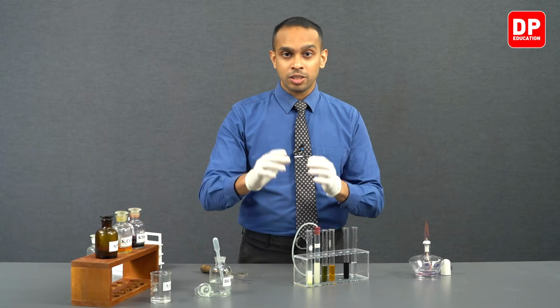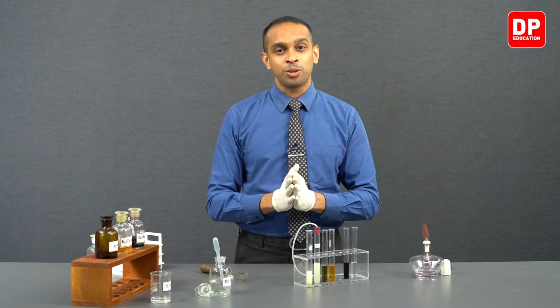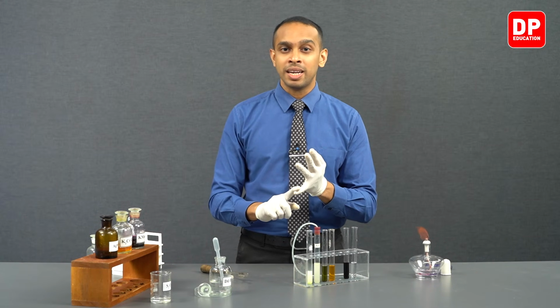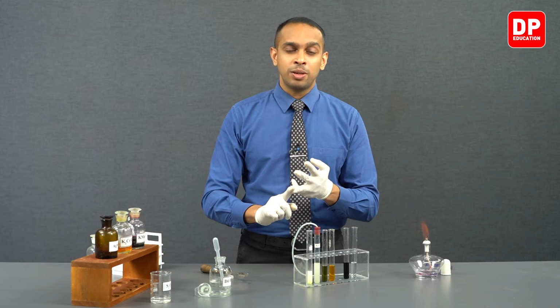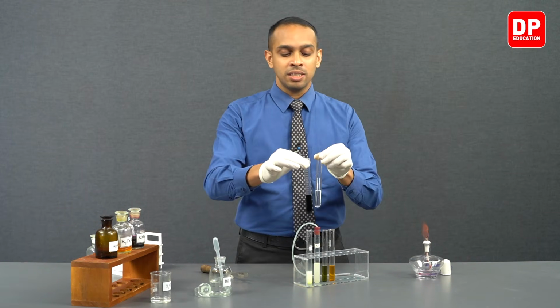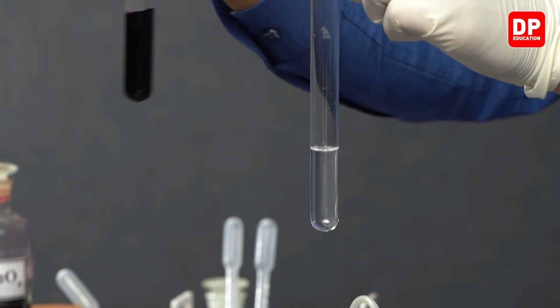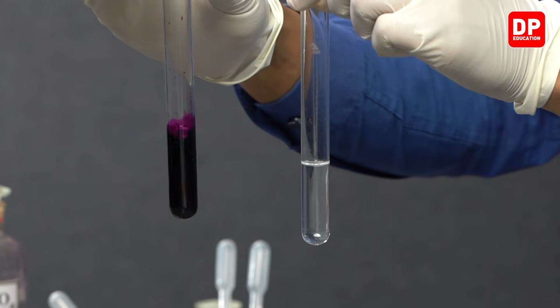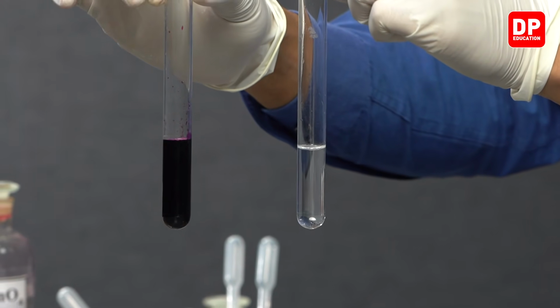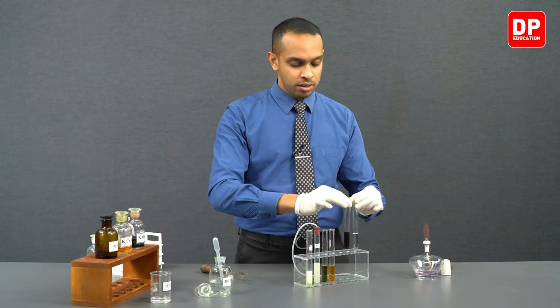To confirm the presence of sulfur dioxide, we can send sulfur dioxide through acidified potassium permanganate or acidified potassium dichromate solution. When we send sulfur dioxide through acidified potassium permanganate, the purple color completely disappears to produce a colorless solution.